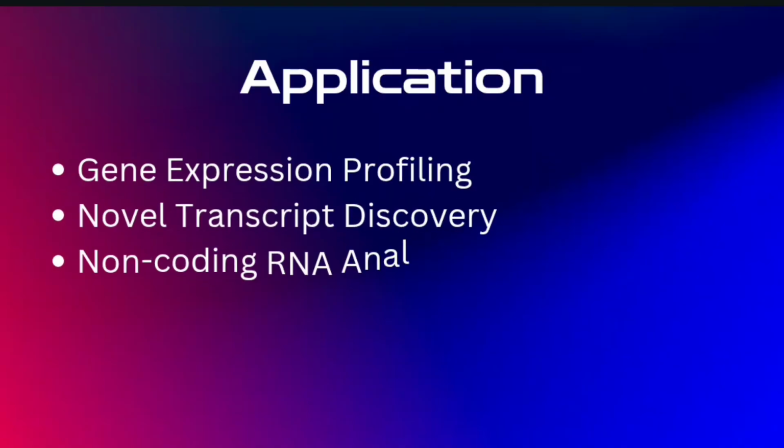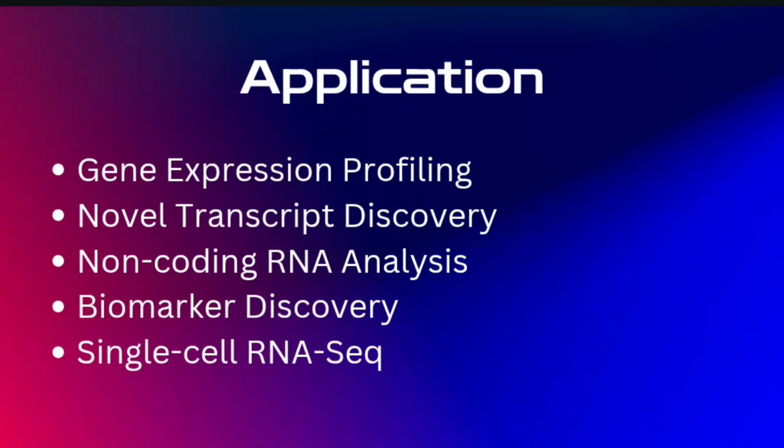There are certain applications of RNA sequencing. For example, gene expression profiling that compares expression between healthy versus diseased tissue. Novel transcript discovery helps in finding new genes, isoforms, and fusion transcripts.